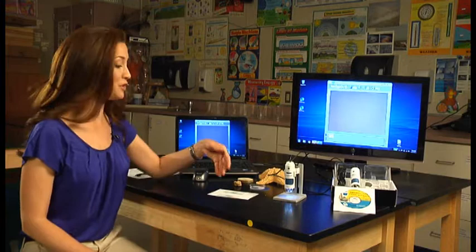Hi, I'm Shannon, here to give you a quick overview on the SmartScope handheld digital microscope. It's great because you can use it in any classroom like a traditional microscope and view slides.